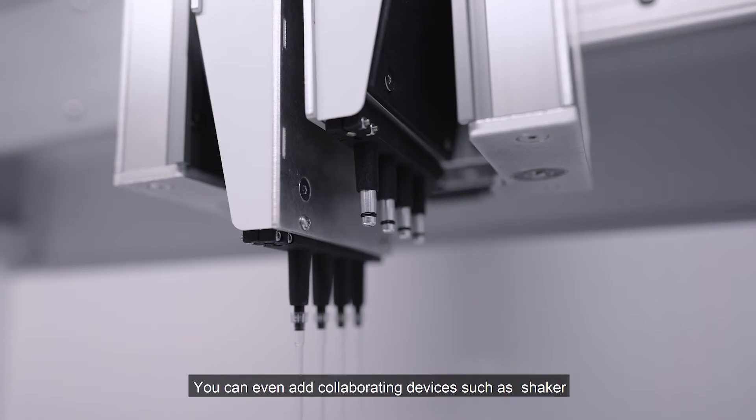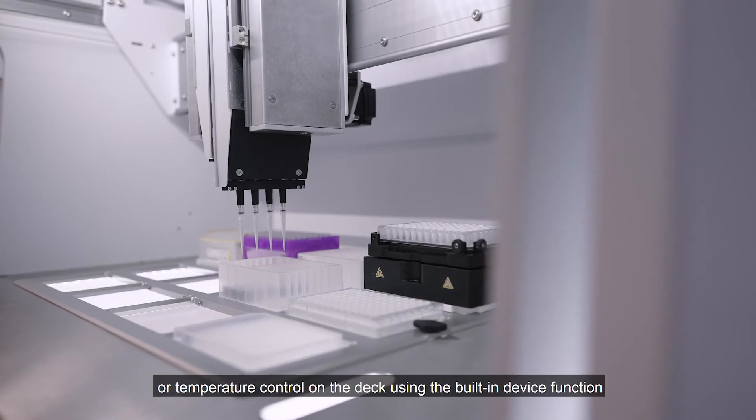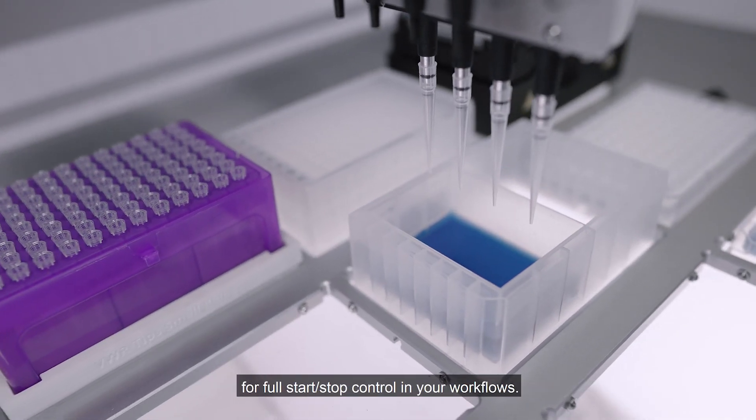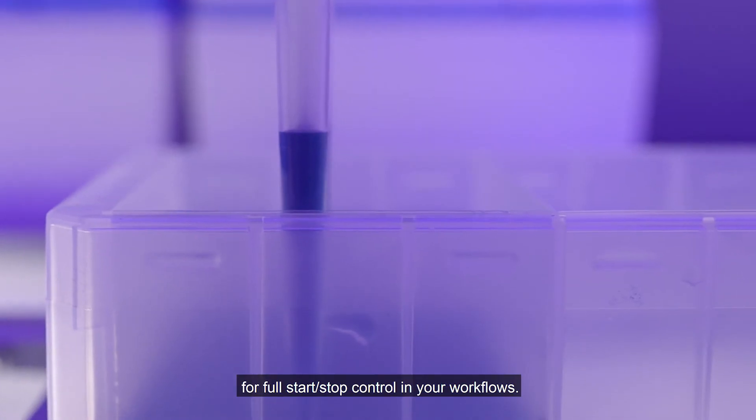You can even add collaborating devices such as shaker or temperature control on the deck using the built-in device function for full start-stop control in your workflows.